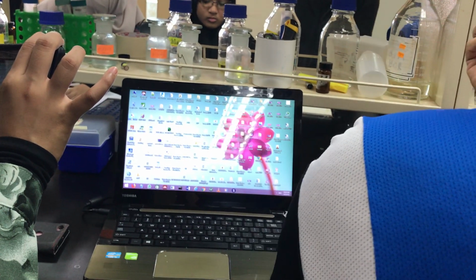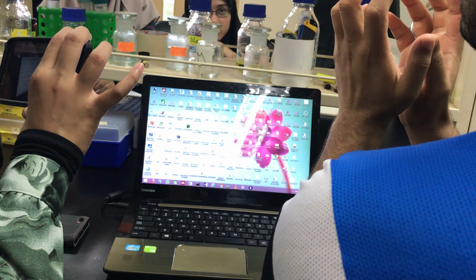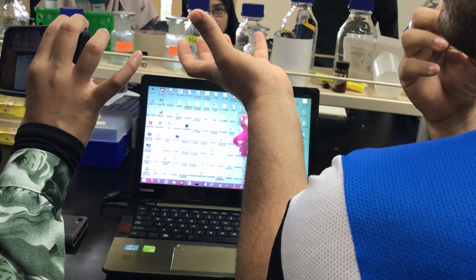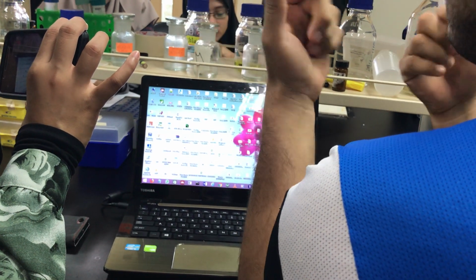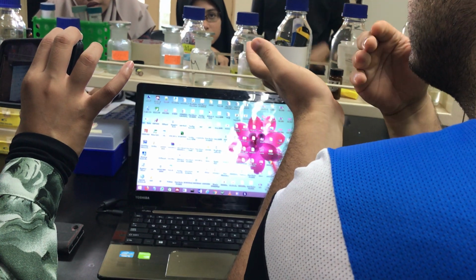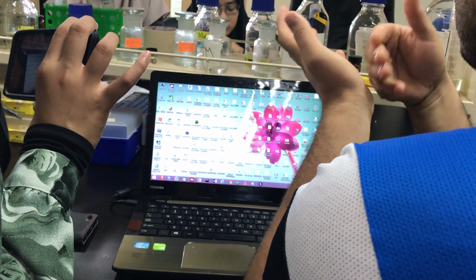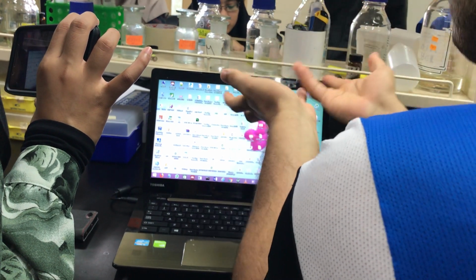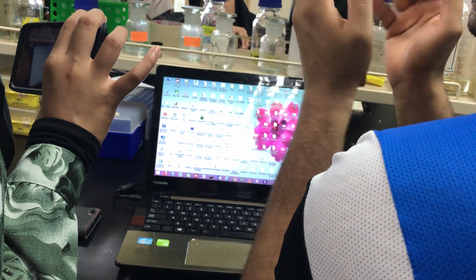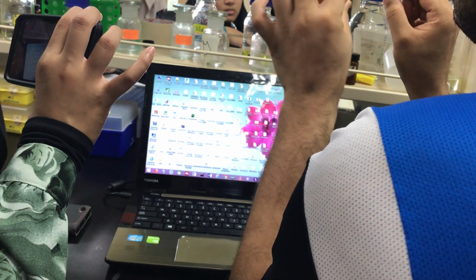Okay. The software is intelligent software. It will correlate between the fractioning group and the activity. Sometimes by your eyes you will not see the difference among them, because we have 6 extractions and you will not see all the differences among the spectra. We give the software all the data as numbers, not the spectra, only numeric. The software will see the difference.